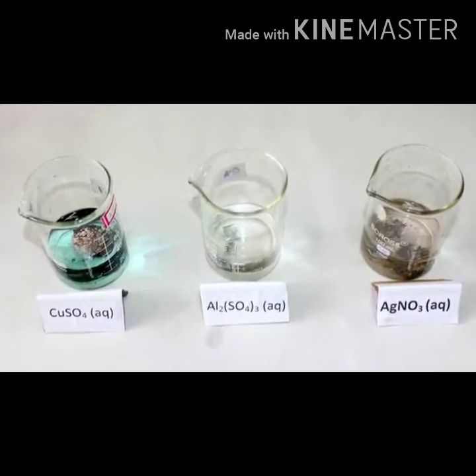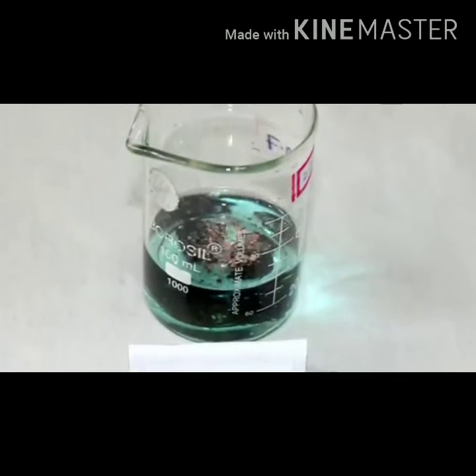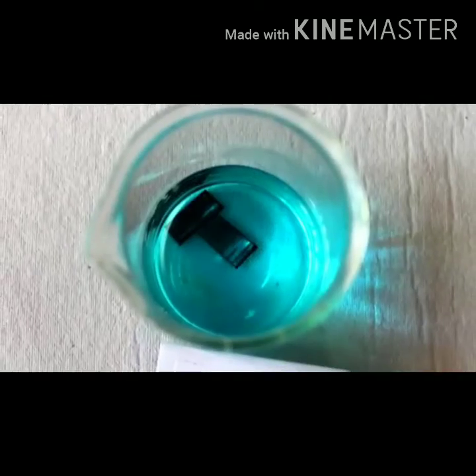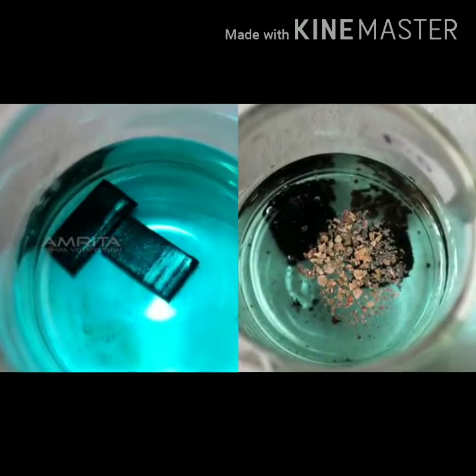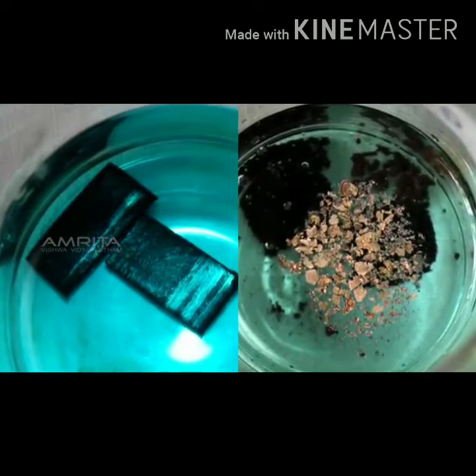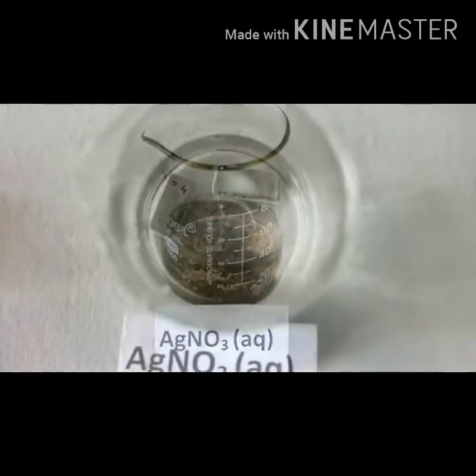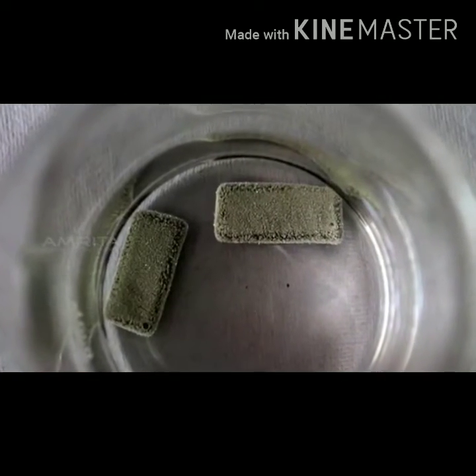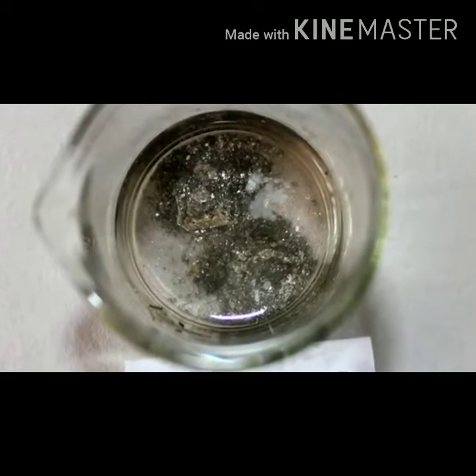After a day, we can observe that red-brown particles of copper settle down at the bottom of the copper sulfate solution. This indicates that zinc is more reactive than copper and it displaces copper from the copper sulfate solution to form zinc sulfate. In the case of silver nitrate, since zinc is more reactive than silver, it displaces silver from silver nitrate solution and particles of silver settle down at the bottom of the beaker.